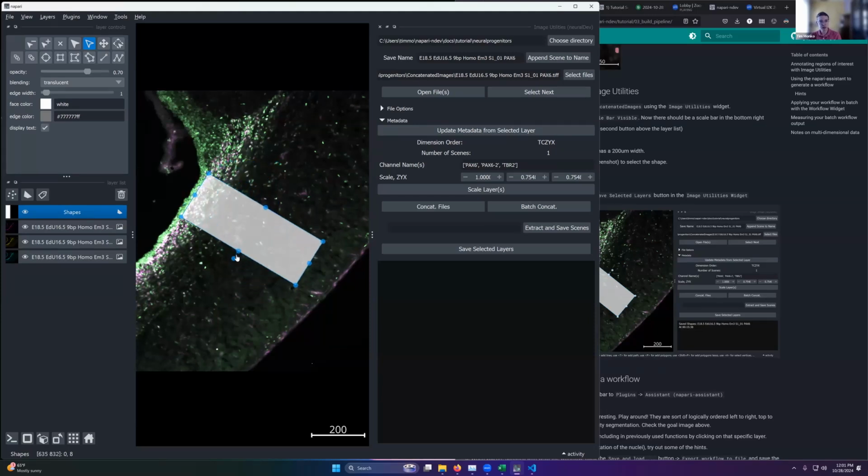And that issue is that once you rotate an object and then try to move it into place, sometimes it's really hard to select it. Like you can see here, I got it deselected and it's not moving. If that happens, you can try to re-rotate it and move it. If that doesn't work, just make it a little longer and you'll be able to move it again. It's really irritating, but again, it'll be fixed in the next update of Napari. If you downgrade to Napari 0.5.3, this bug is not present. So if you're currently wanting to do this, it's a little buggy, work around that. If you're watching this workshop in the future, just use the most recent version of Napari and it shouldn't be an issue.